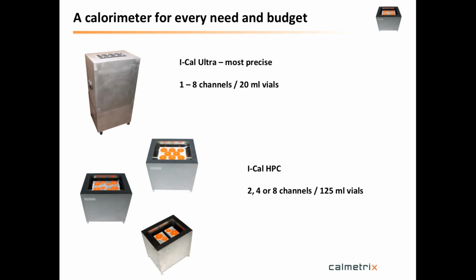You could very well, of course, do your ASTM C1702, and those all comply with the norm. So the heat of hydration testing as per ASTM. You could do some benchmark testing with other cements that you have. You could actually look for changes that you see when you change something in your plant operation, like switch to a different type of fuel, or you have a variation in the raw materials. All this can be tested, and as I said, it's relatively easy and doesn't require a trained operator for that.